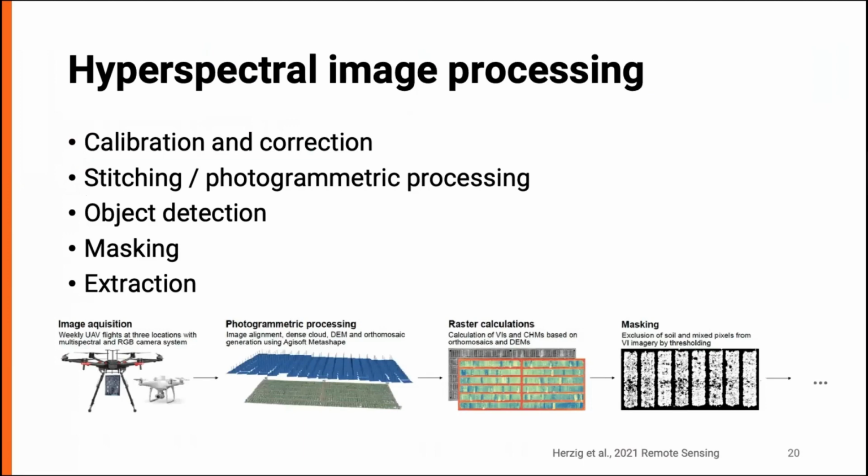Okay, so image processing starts with the steps that you might follow for normal RGB image processing. And Heather talked about this a lot last month, but for things like UAV images, you're going to have to stitch them together and then parse out where your plots are within that image. And if you're taking images on a normal camera on the ground, you're still going to have to parse out the background versus your sample.